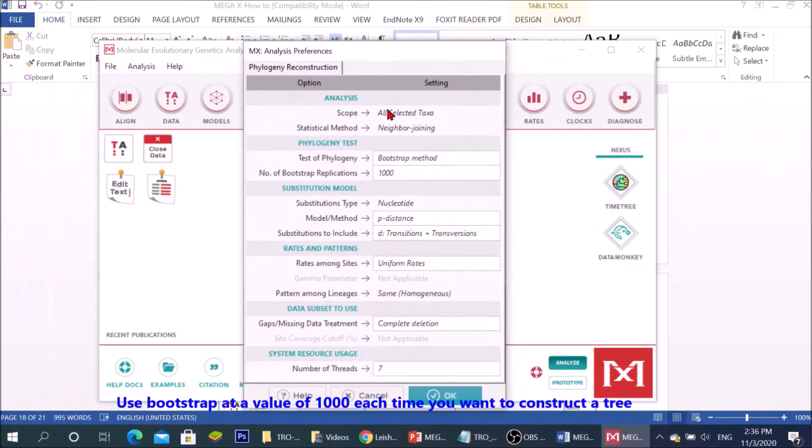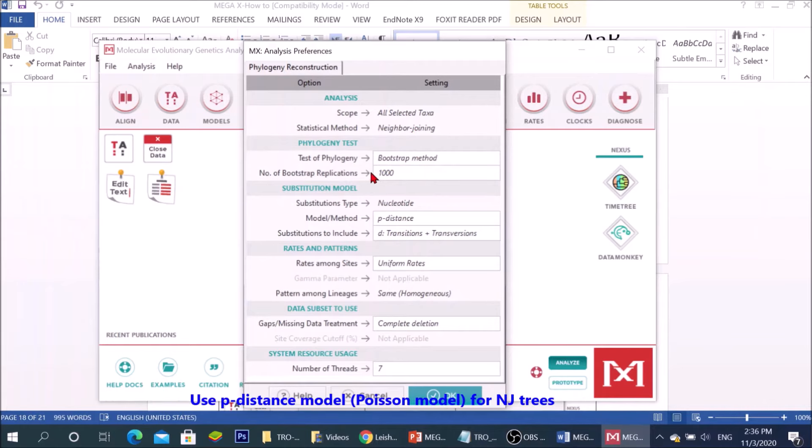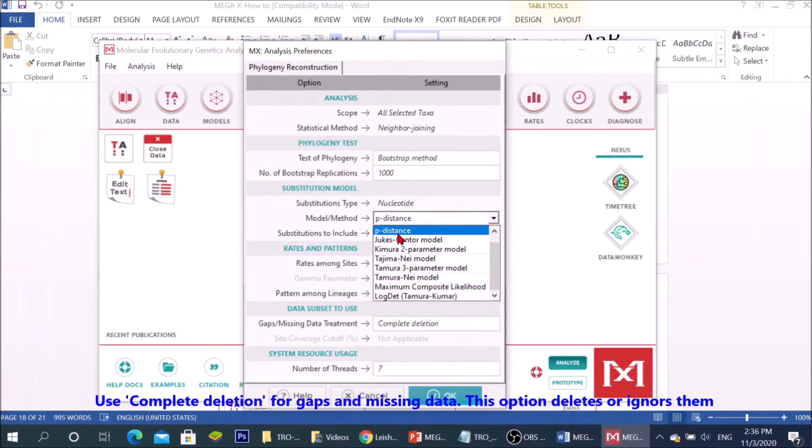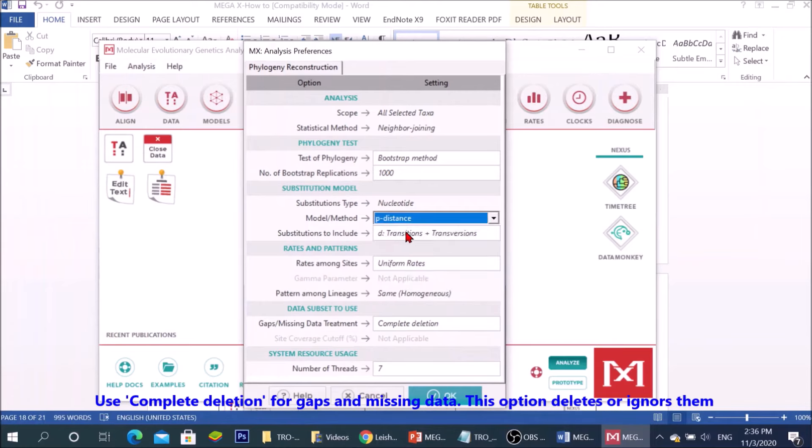Use bootstrap at a value of 1000 each time you want to construct a tree. Use Poisson model for NJ trees. Use complete deletion for gaps and missing data.